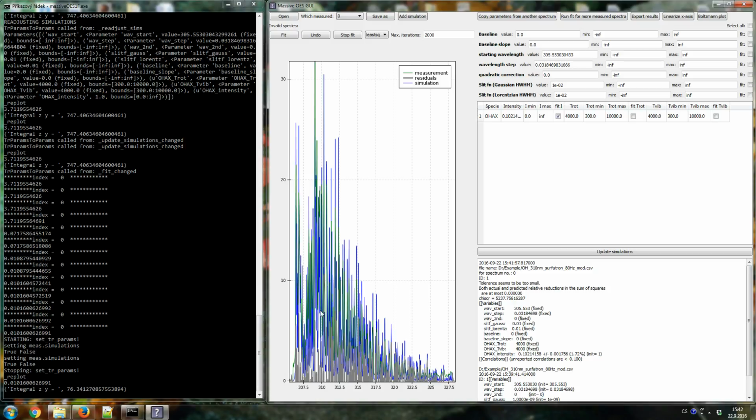Okay, the overall picture is quite nice, but the resolution is not very good, so I will probably want to zoom in. How to zoom in?